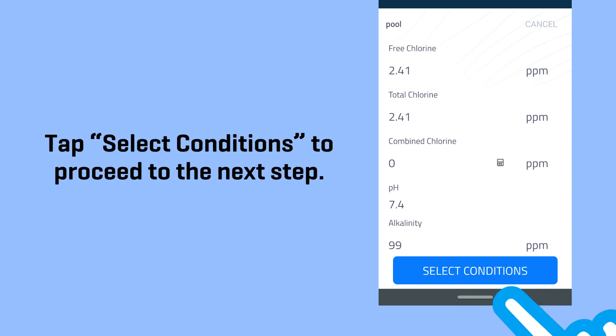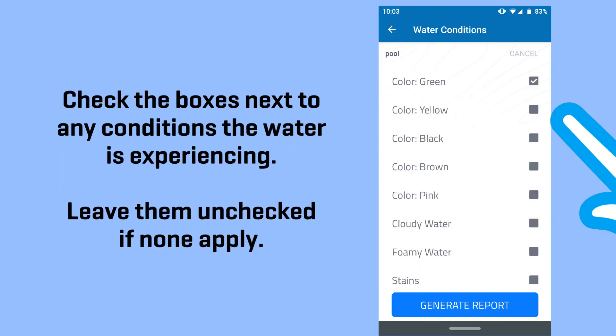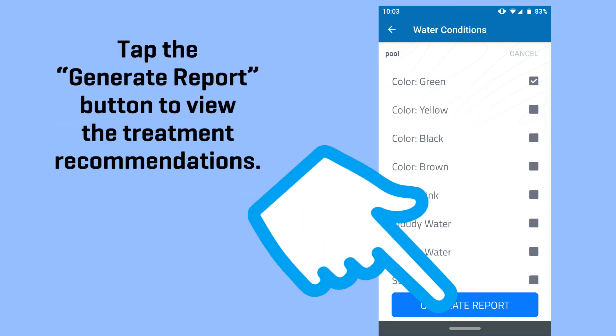Tap select conditions to proceed to the next step. Check the boxes next to any conditions the water is experiencing, and leave them unchecked if none apply. Tap the generate report button to view the treatment recommendations.